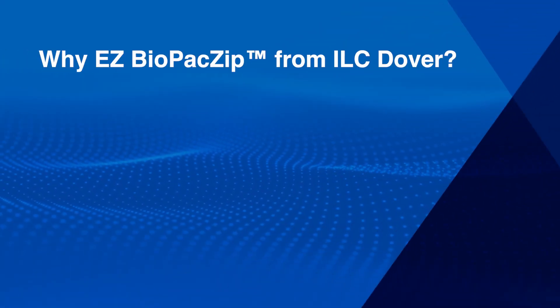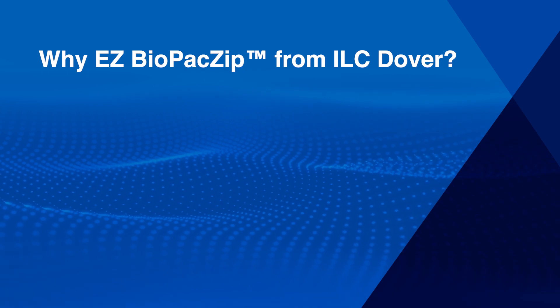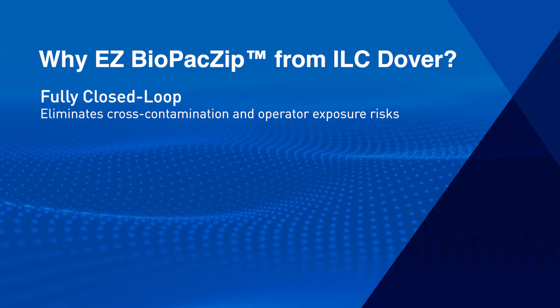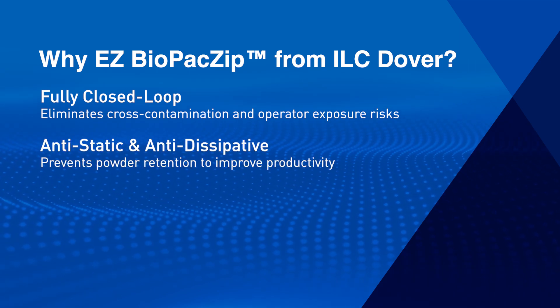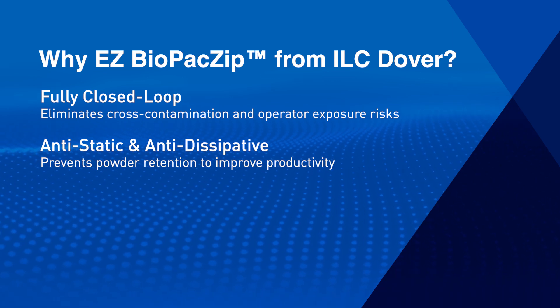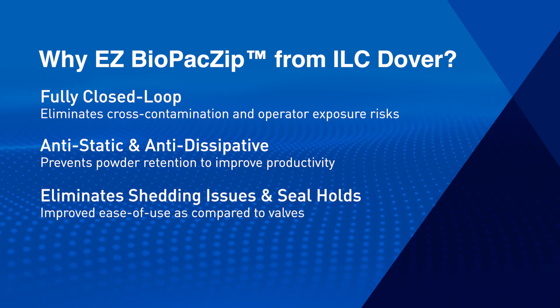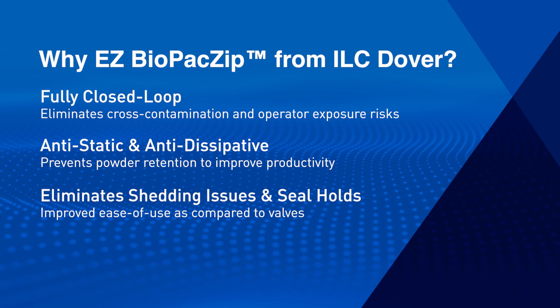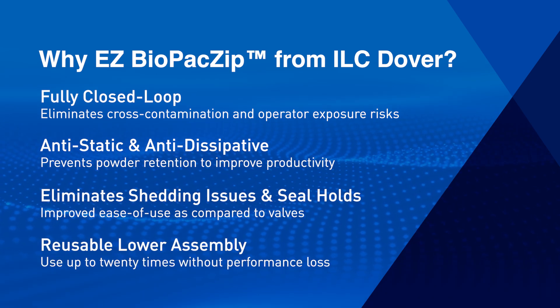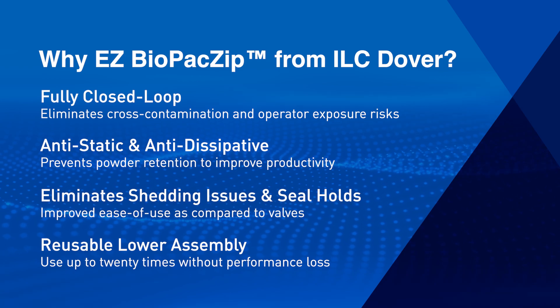Why EZ Biopack Zip from ILC Dover? Its fully closed loop design eliminates the risk of cross-contamination and operator exposure risks. Its anti-static and anti-dissipative film prevents powder retention to improve productivity. It eliminates shedding issues in seal holds for improved ease of use as compared to valves. The reusable lower assembly can be used up to 20 times without performance loss.